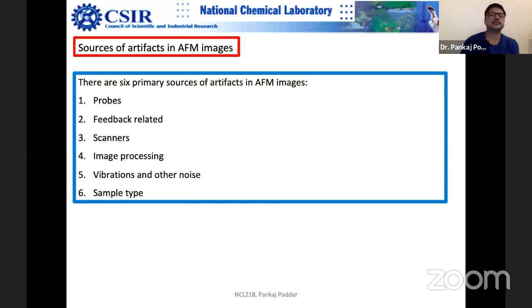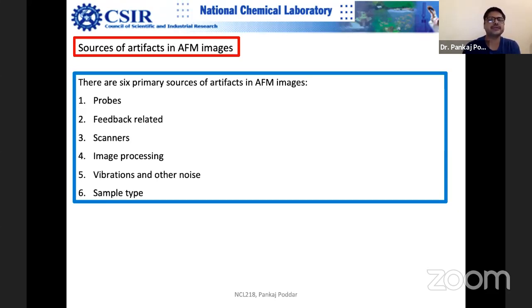The final source is sample type. Your sample can also create lots of artifacts. In fact, all these points are equally important. Even the last point — sample type — creates a lot of problems because if you have a bad sample, that can create contamination problems. So probe contamination is linked with sample type; sources one and six are linked quite closely.